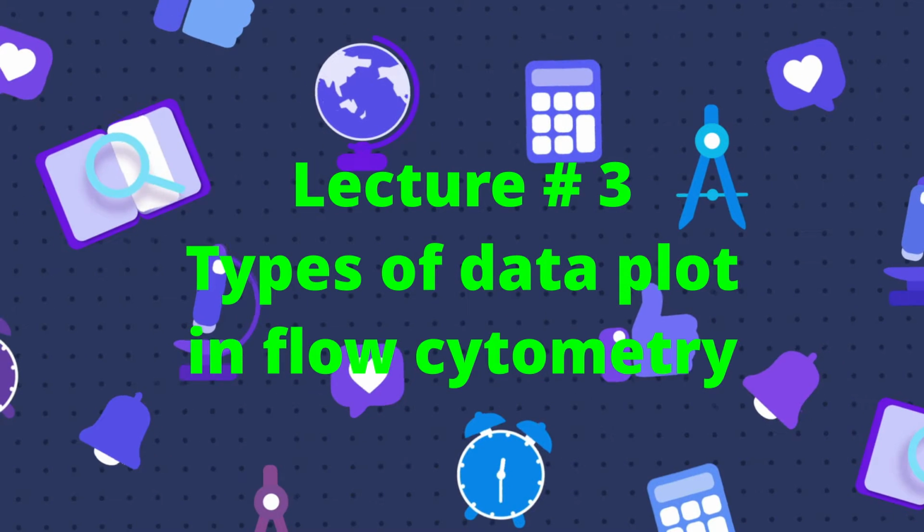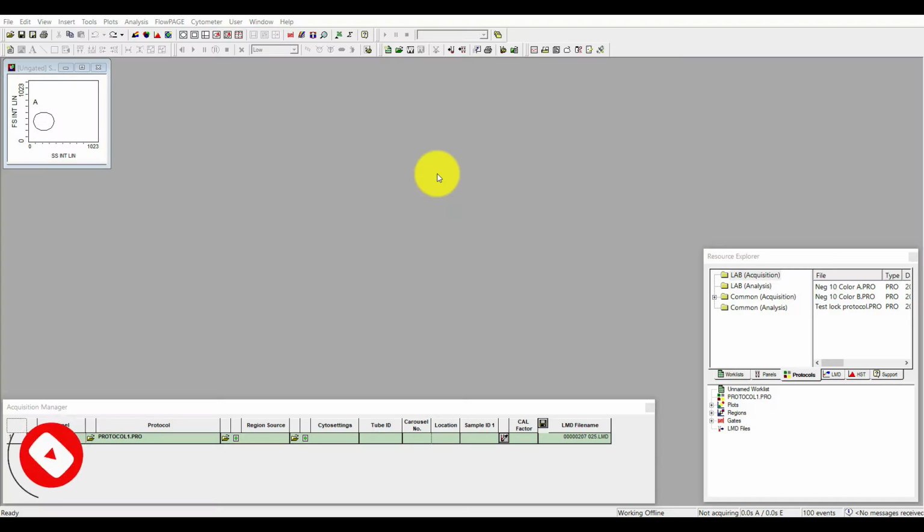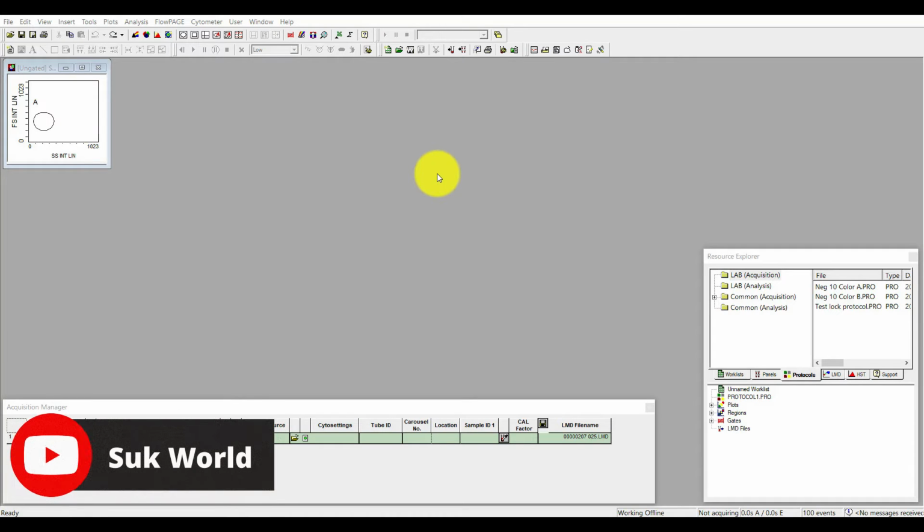Today this lecture is about how many types of data plots you can find in flow cytometry, which we usually use to analyze the data.